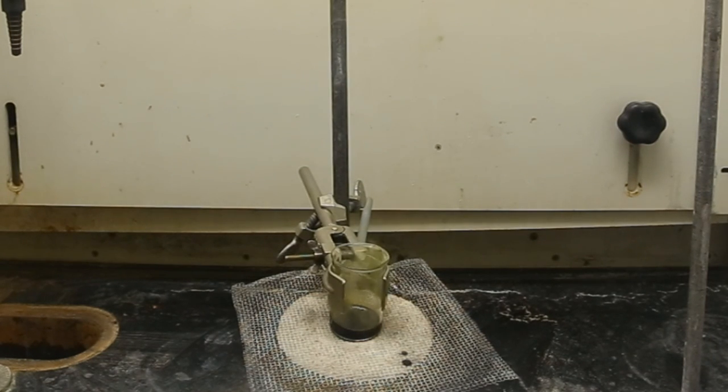I did not have enough P-Nitroaniline to test this thoroughly, but I believe that the ratio of sulfuric acid to P-Nitroaniline, as well as the container that the reaction is carried out in, plays a big role in the final result. I believe that the walls of the beaker were too high compared to the level of the P-Nitroaniline, and I believe this negatively affected the results.